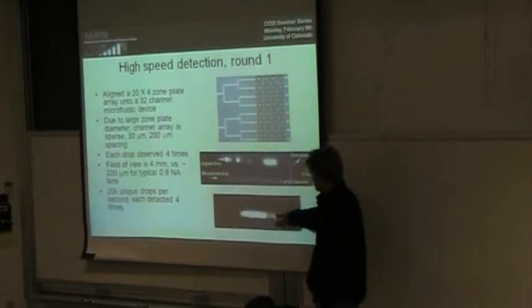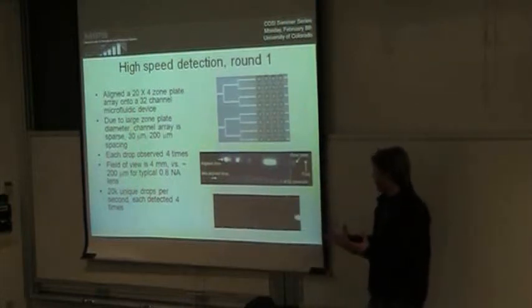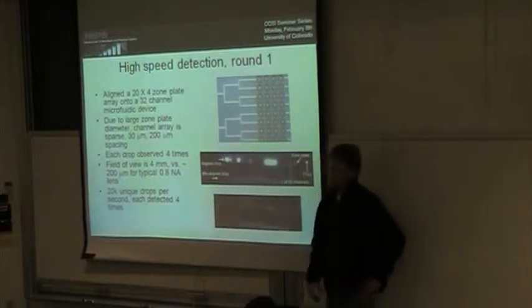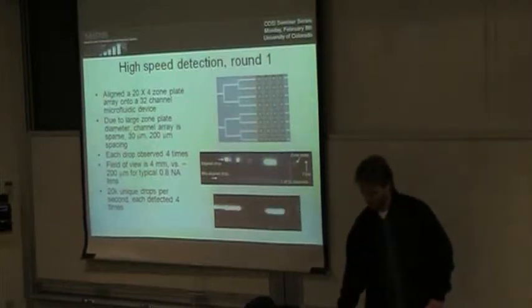So this intensity is 200 times higher than this. Then when we run this camera fast, and we reduce the amount of fluorophore in each drop, you can't see these guys anymore, and you can only see the drop when it is in the detection region of the lens.